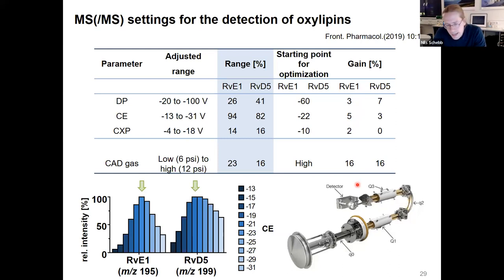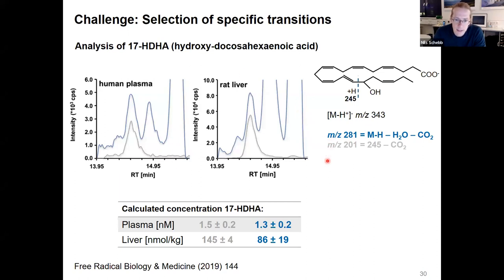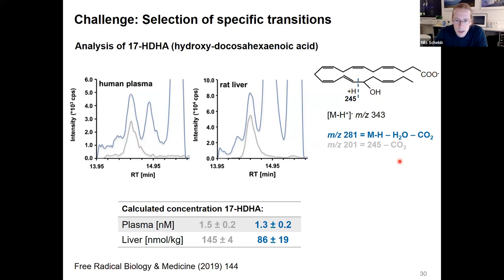The second aspect for transition selection is that they should be as selective as possible. You should avoid fragmentations which are not specific — for example, the loss of carbon dioxide or loss of water — which, as you can see from the example of 17-HDA, leads to a much noisier signal compared to a specific fragmentation from alpha cleavage followed by loss of carbon dioxide. Selecting the transition that is both specific and sensitive is really a challenge.